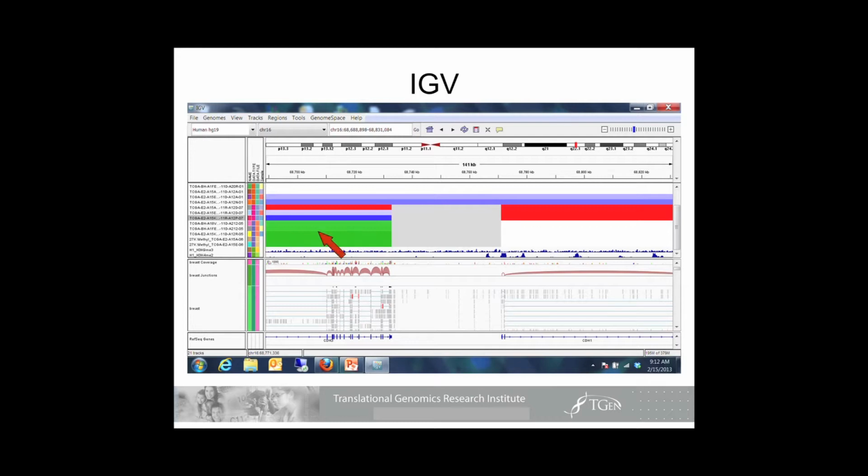I believe the gene expression data is, no, it's coded the same way. So it's overexpressed. And then you have methylation data. Green is up, red is down. And you can see that we have a region of heavy methylation here.